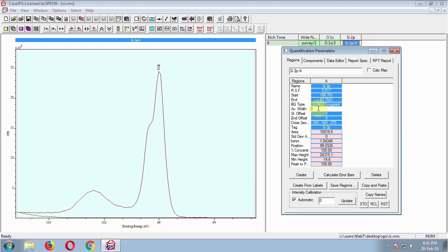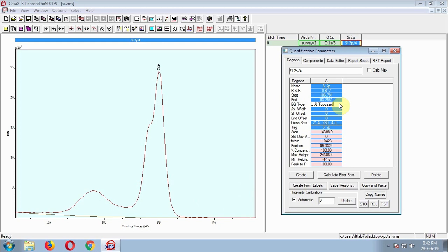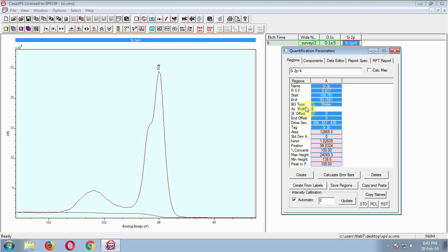USI O2 does not fit well. Next, changing to U-aluminium 2Guard, short form UAL. This looks okay. Let's see others too — this is similar to one of the previous functions. And the last one, U-polynomial 2Guard, short form Upoly — a very little change. Let's change back to Shirley.